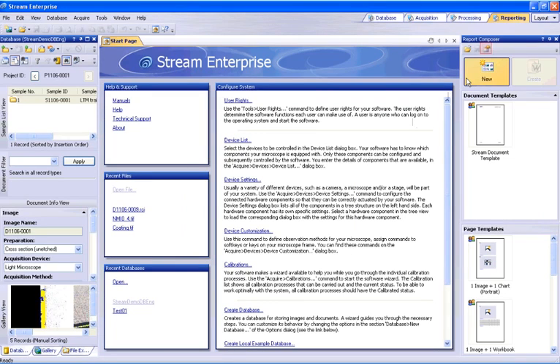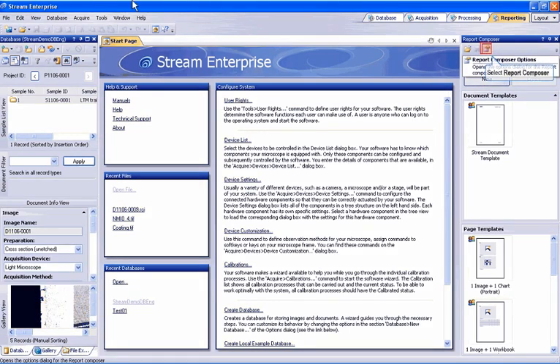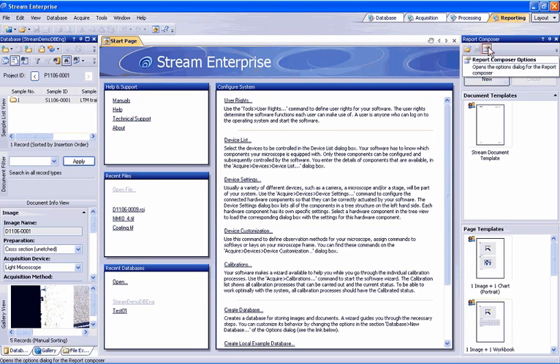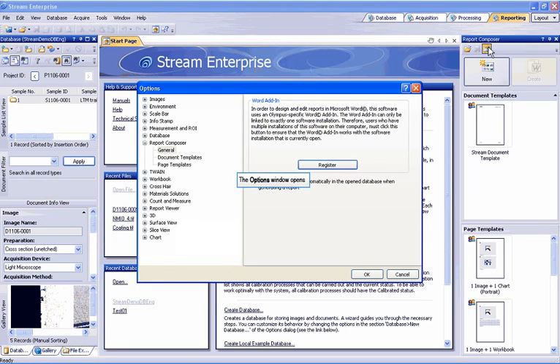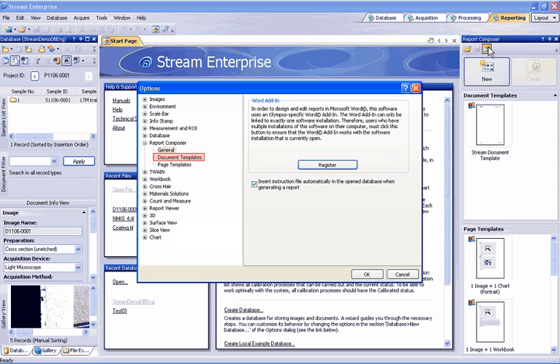Now go back into Stream Software and be within the Reporting layout. Select the Report Composer Options menu item. This will open the Options window and show the Report Composer options. You can select the general options here, the Document Template Location or Page Template Location. Your document template could be a company standard or you can generate your own.